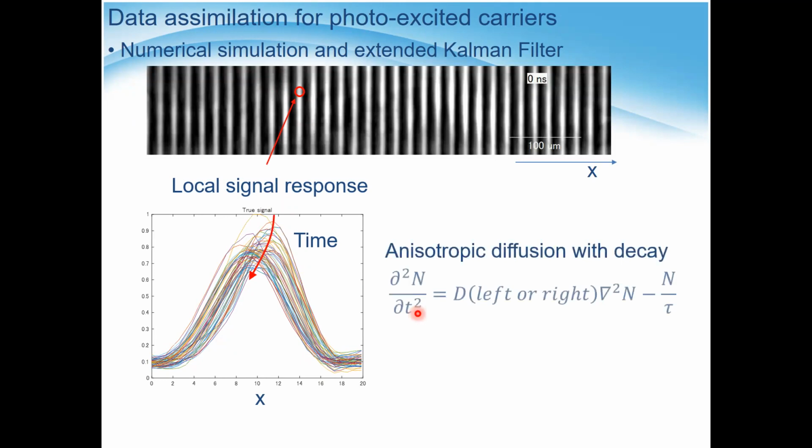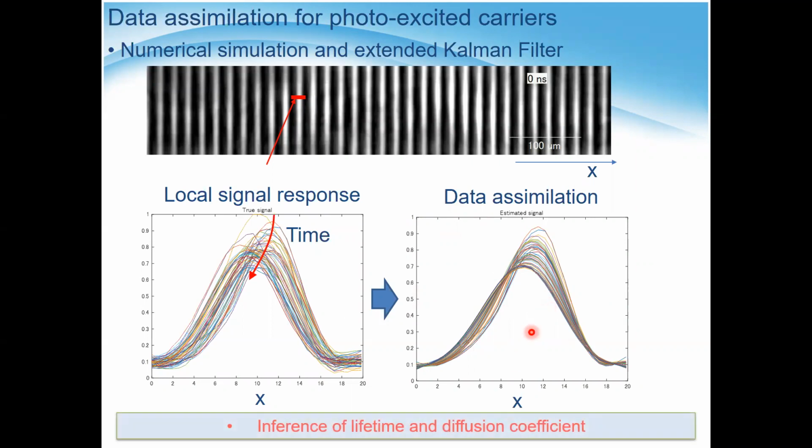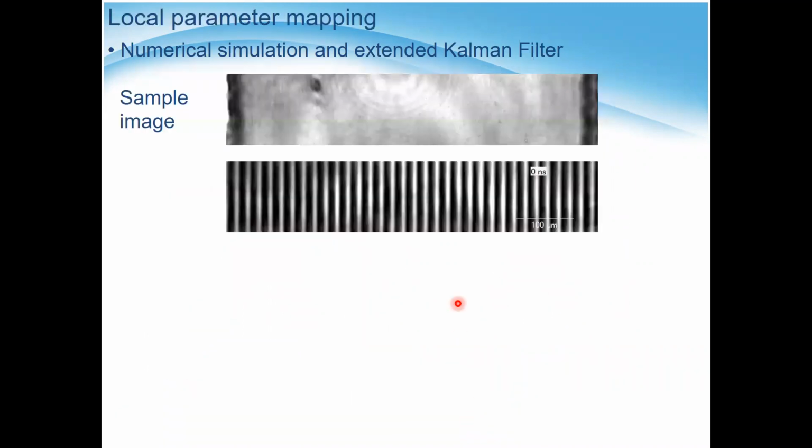And then this could be modeled by the partial differential equation, as I mentioned. And then by applying the data assimilation, we could recover this kind of response. And during the data assimilation process, we could also obtain the lifetime and the diffusion coefficient, as I mentioned.